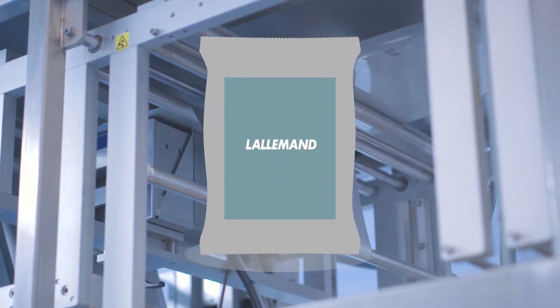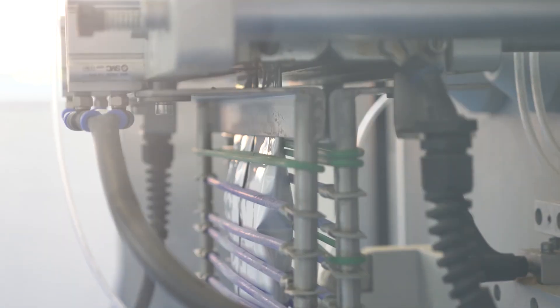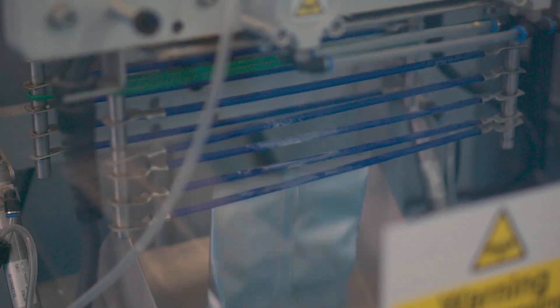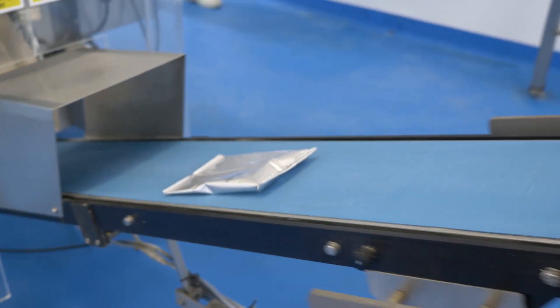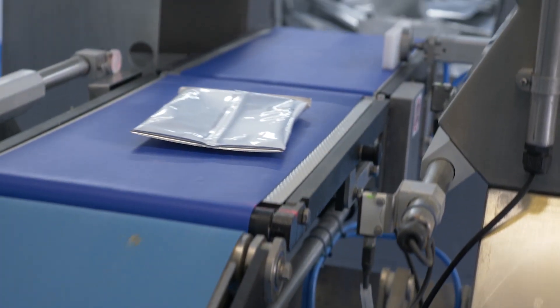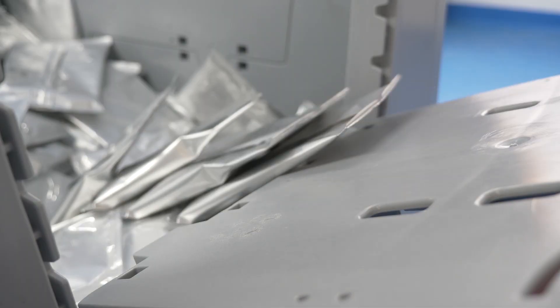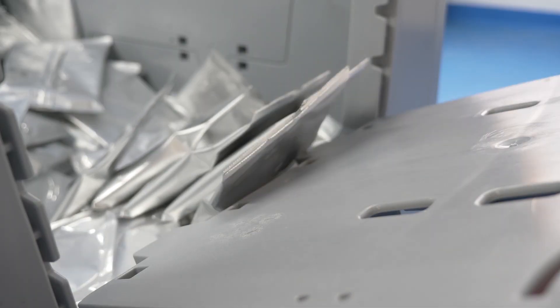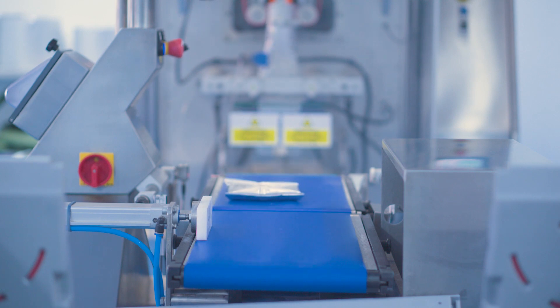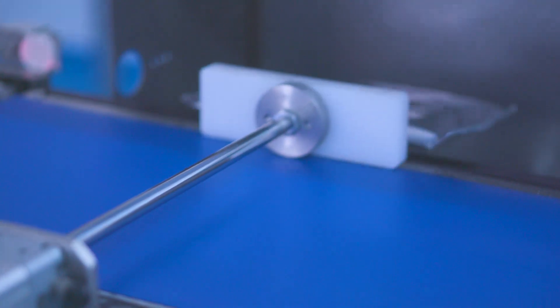The final stage of production requires the formulated powder to be placed in preformed oxygen barrier sachets which ensure product longevity. The sachets are filled, sealed, and batch coded automatically on a specialist machine. The weights of the sachets are monitored. If the sachet is not the correct weight, it will be removed by the machine to a reject container.